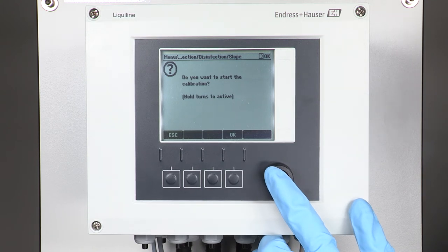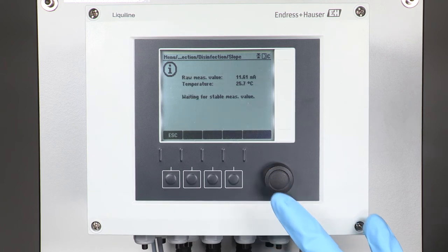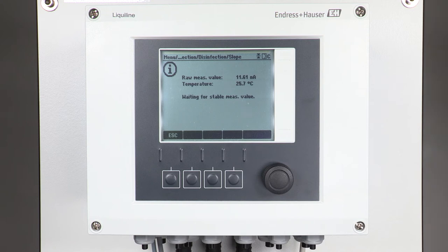Start the calibration and press OK. The transmitter checks if the stability criteria are fulfilled and stores the present value for a later adjustment. We continue with the next step in the calibration menu.